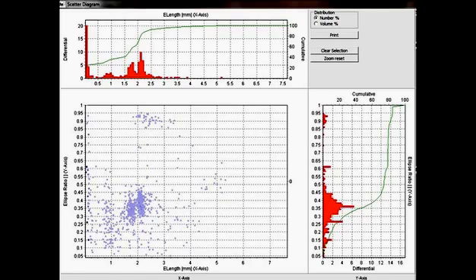graphs. In this example, length is displayed on the top graph and ellipse ratio, an aspect ratio shape parameter, on the right graph. The scatter diagram can be used to quickly explore the relationship between any two morphological parameters and then to isolate areas to focus on those of particular interest, as illustrated on the next slide.